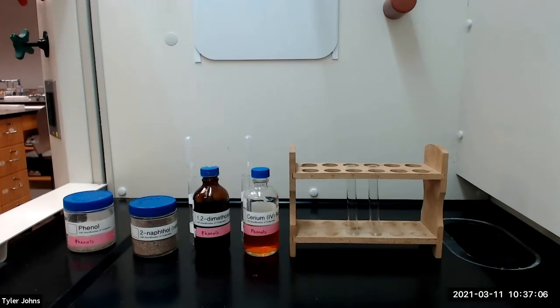Since alcohols also give a color change with this reagent, you will first need to distinguish between alcohols and phenols by determining the solubility behavior of your compound. Phenols should be soluble in sodium hydroxide, whereas alcohols will not dissolve in aqueous sodium hydroxide.